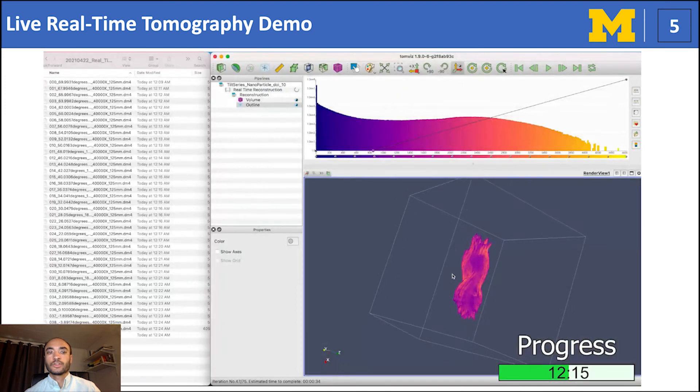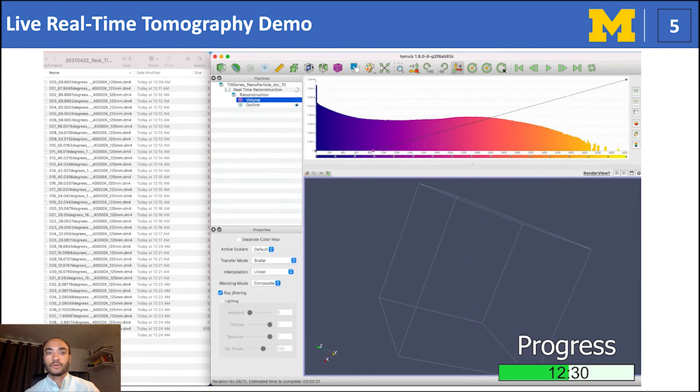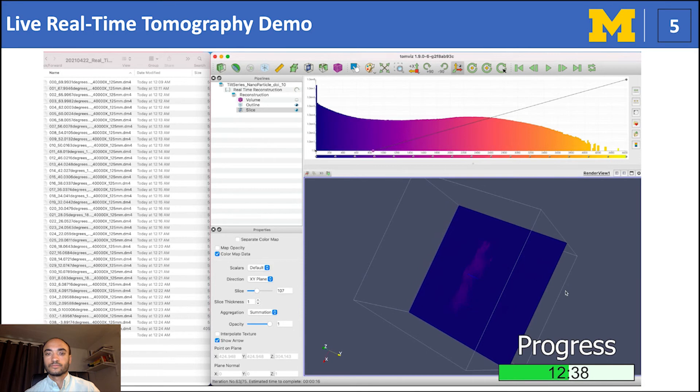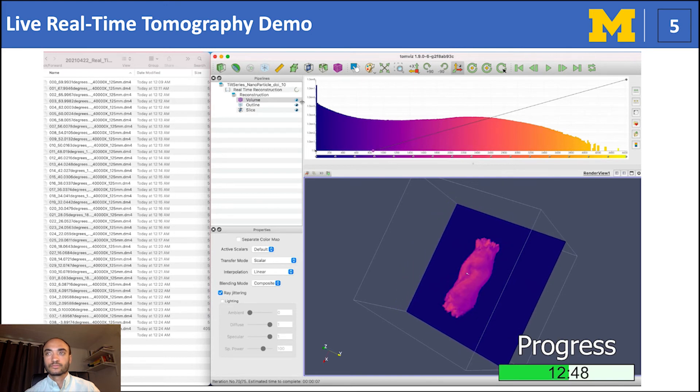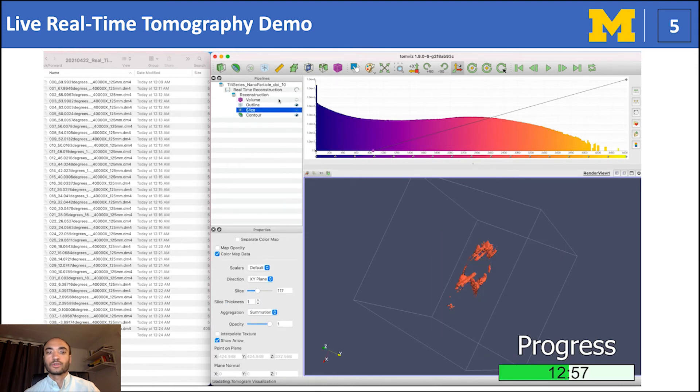At 50% completion, we can observe substantially more features. I can already assess the specimen's chirality, characterizing it as a right-hand twist, and measure the petal width and length along the edge of the nanoparticle. Not only so, I can also seamlessly slide between 2D slices. I can also select multiple visualization modules or observe its volumetric structure with shaded isocontours.